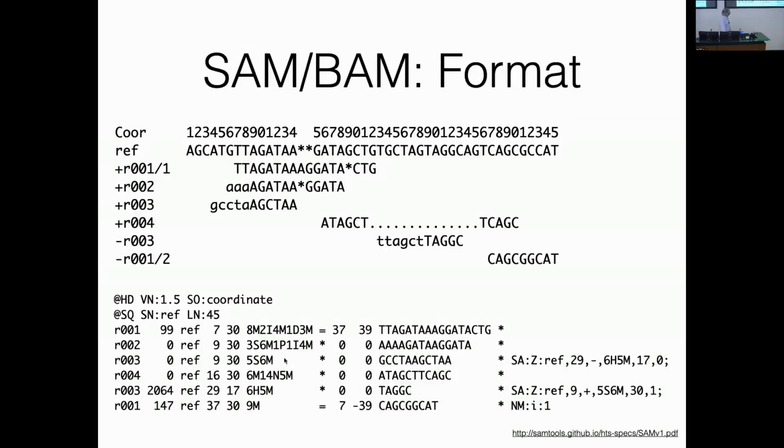And then this other one here is basically you're trimming off. It's skipping, but it's a little slightly different. And there's some other information here. Here's the sequence itself of the read. And it's not showing you here the quality scores, but normally in a BAM file you'd have that. And then this is the estimated insert size. Remember I told you it can kind of estimate based on where it maps in the genome.